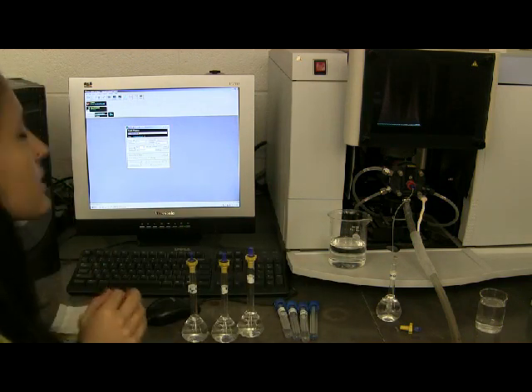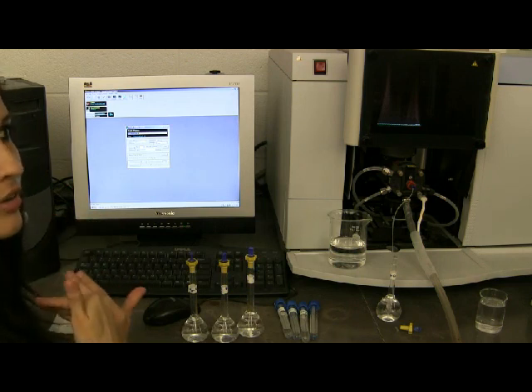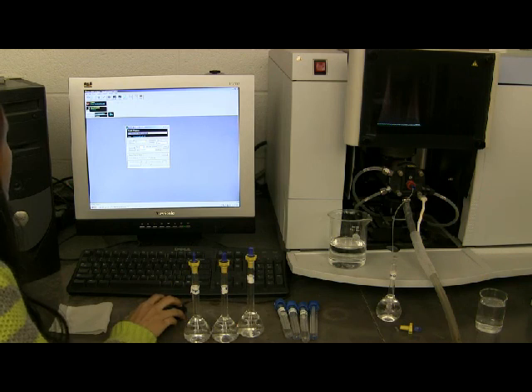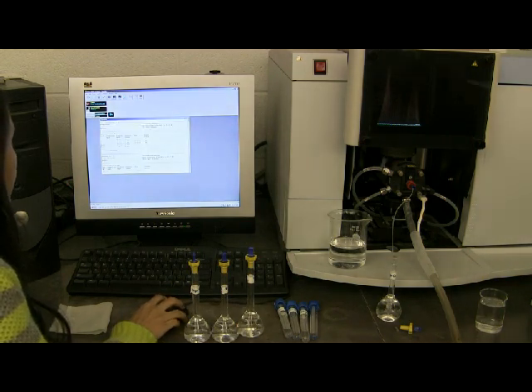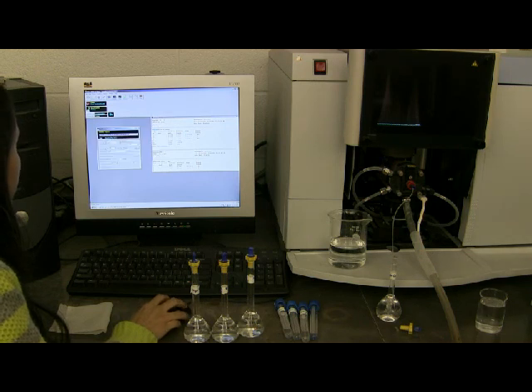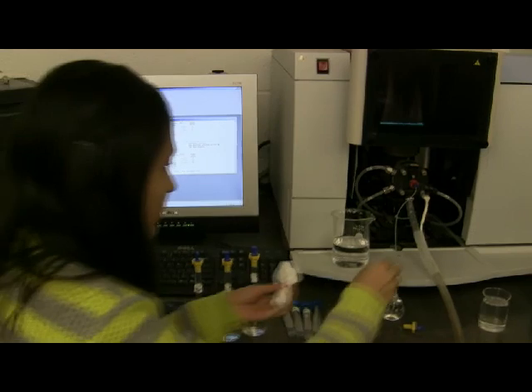And say you want to see your results side by side, you can always just click on results and put it on the side, and just wait, if you want that.